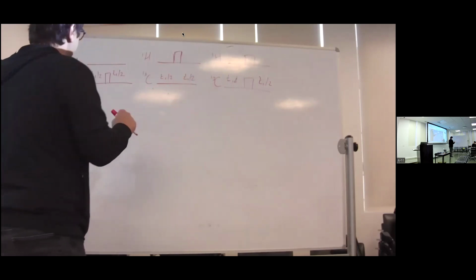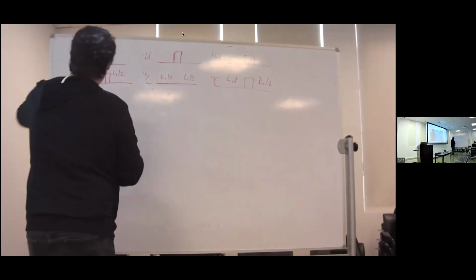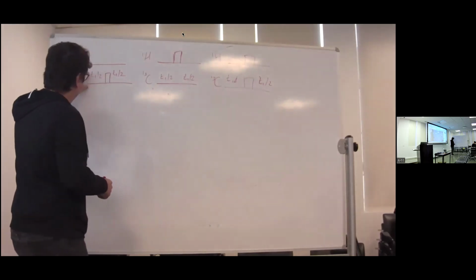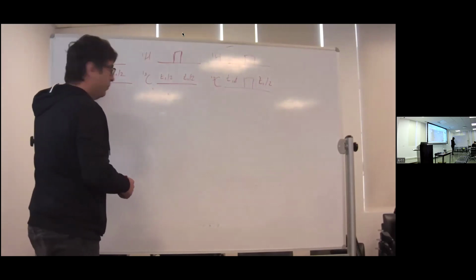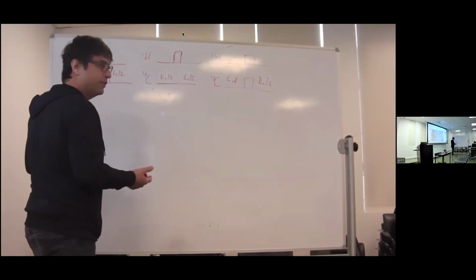So why don't we have volunteers to walk? We have a pulse sequence here that's called an HSQC type element, where we have carbon magnetization, and we're now evolving over time, and we want to compute the evolution of various things of interest.